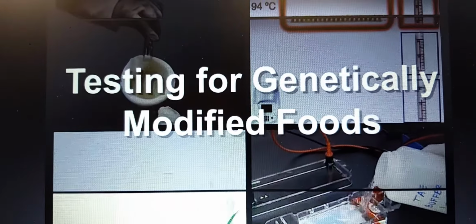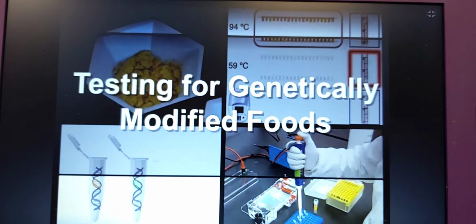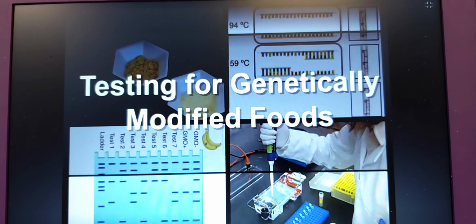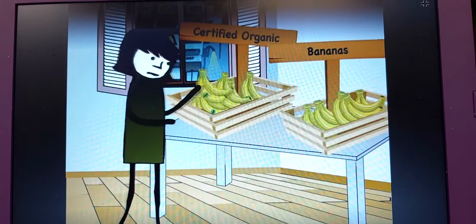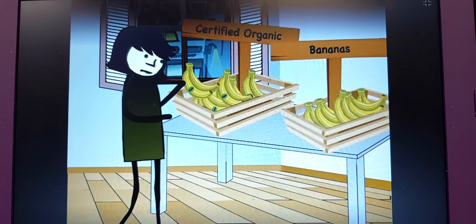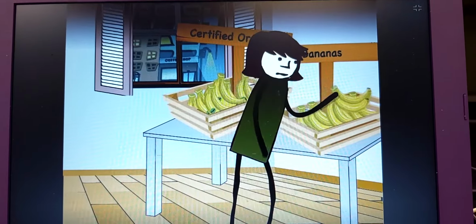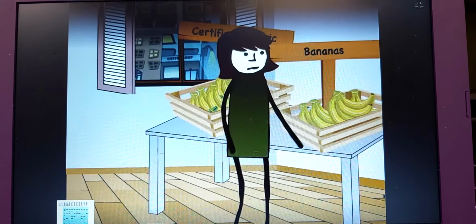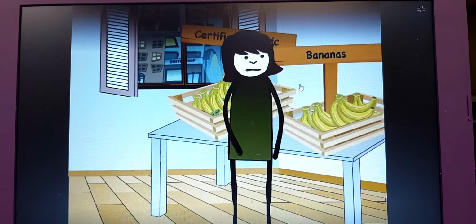Genetically modified foods are products which contain an ingredient or ingredients whose DNA has been specifically altered. Presence of these modifications can be detected using a technique called the polymerase chain reaction. Genetic modification of foods has been a controversial issue due to debated concerns over health and environmental safety. The ability to detect genetically altered DNA in food samples of interest allows for educated decision-making about the safety and potential dangers of using genetically modified organisms, or GMOs, in food supplies.